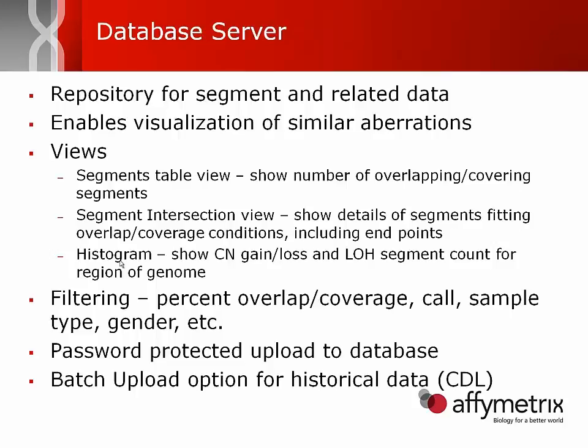You also get a histogram view. The histogram view will be in the detail view, and it shows the segment representation in your database. So you can see all your segments from the database in a histogram view, and we can also filter on that histogram.